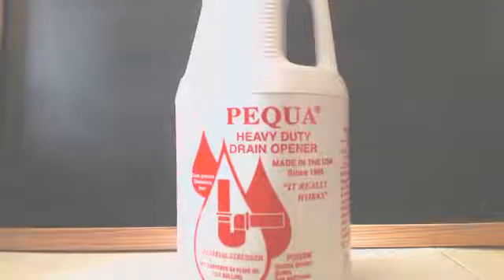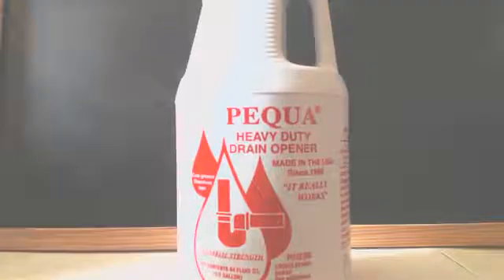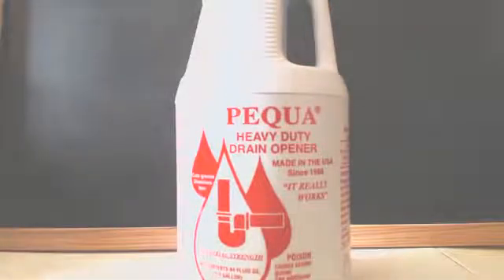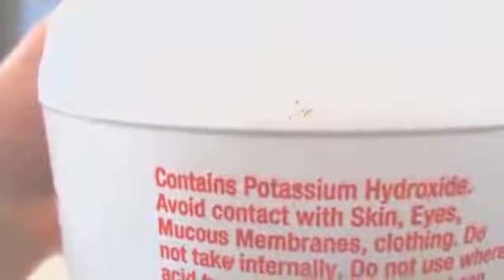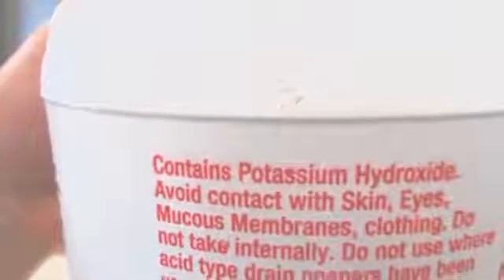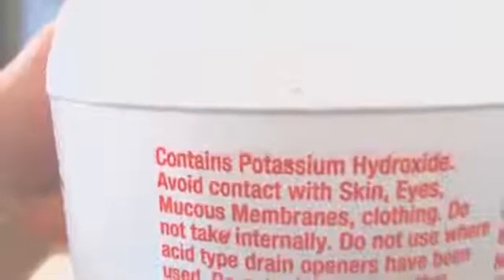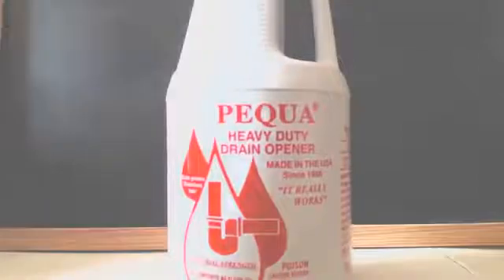Well, this is John Black, super chemist. We're here to make some potassium carbonate. We're going to start out with this Pequa heavy-duty drain cleaner you can get at Lowe's or any hardware store. As you can see from the back, it contains potassium hydroxide.